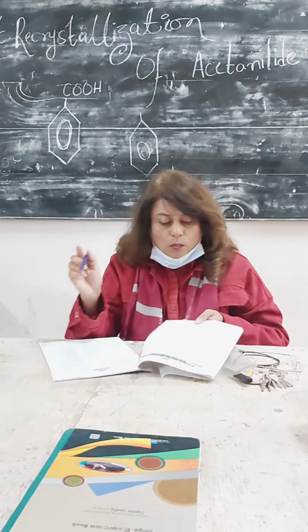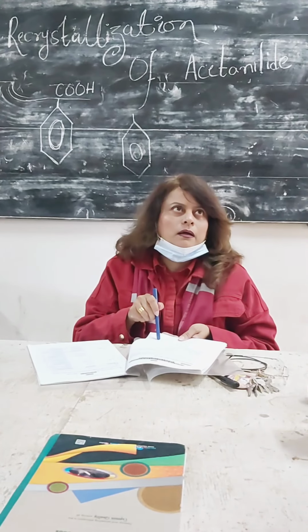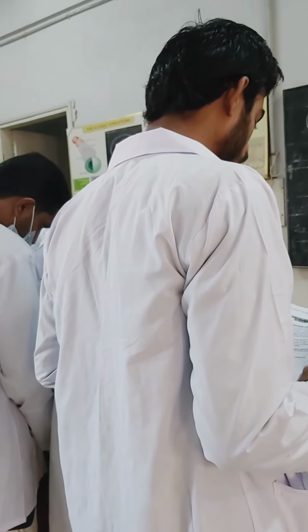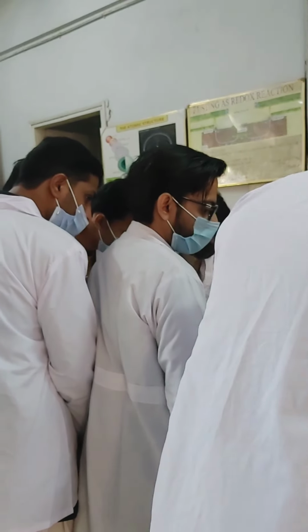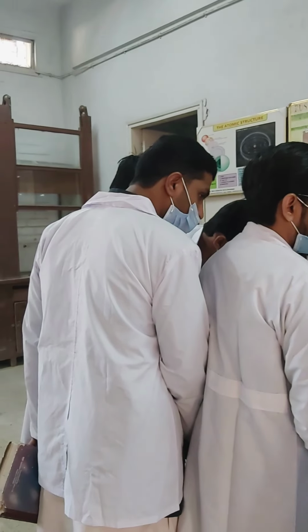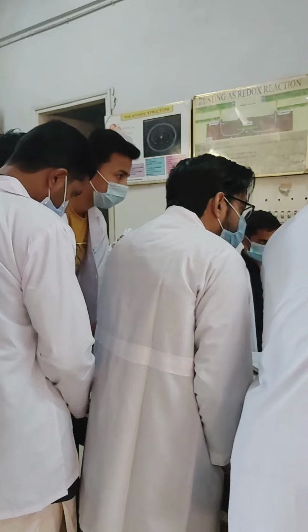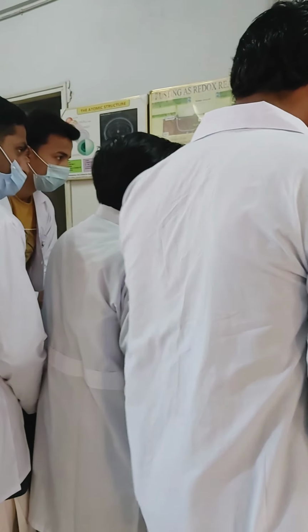Okay, so now your work starts from page number 16. The heading of page 16 is scheme for the identification and detection of known unknown organic compounds. So give me one register and page so I can explain it. Now what you are going to do, you have your compound. Today, as I've told you, I'm going to give you a known organic compound.